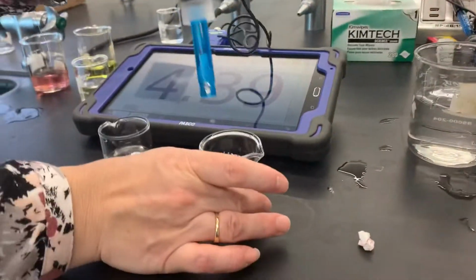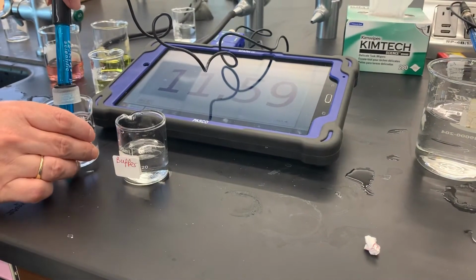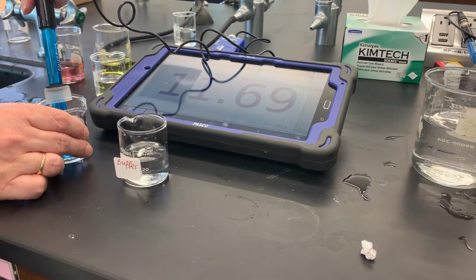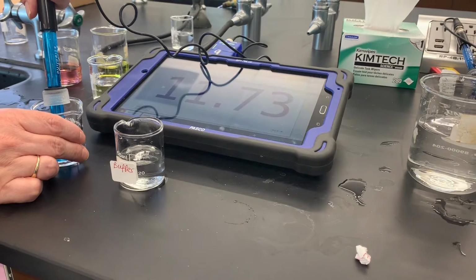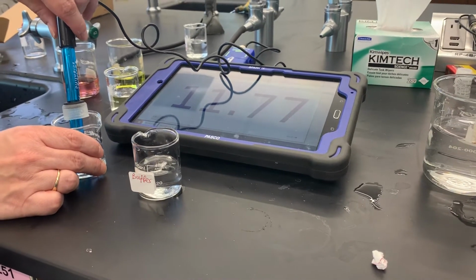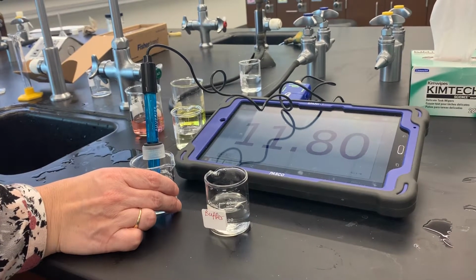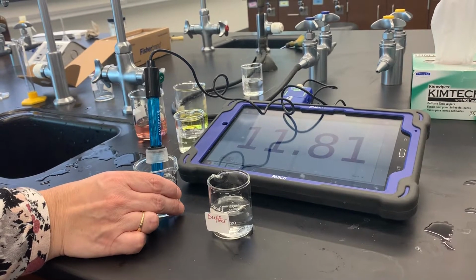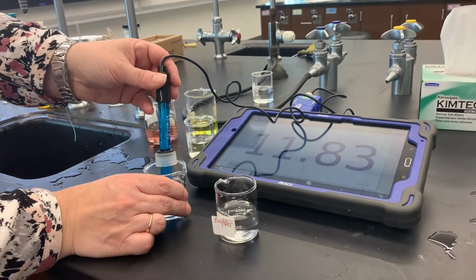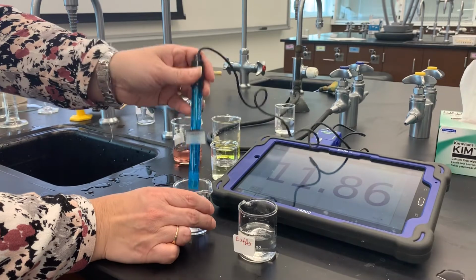And now this is water with added base. And look at this. So water started at around 7, a little bit on the acidic side, and now with only 0.5 milliliters of added NaOH, pH for the water went all the way up to 11.78 or even 11.80 or so. So huge increase in pH in water, compared to the buffer. So how do we explain this? Let's take a look.